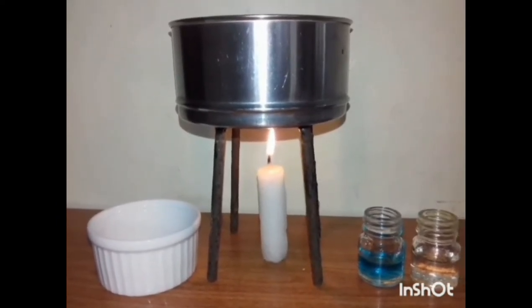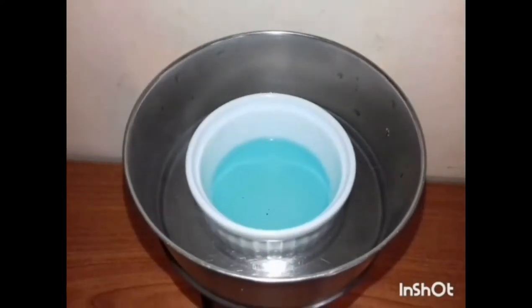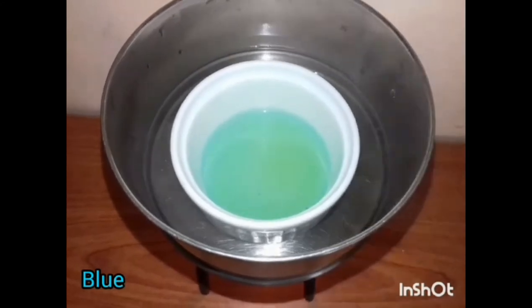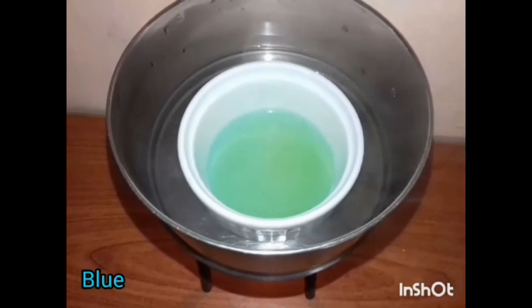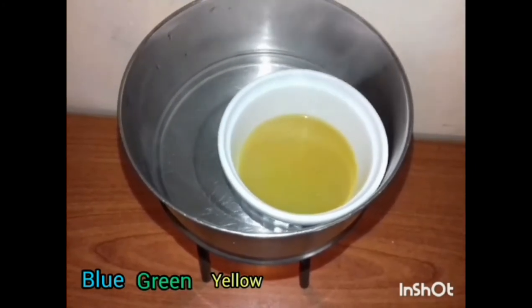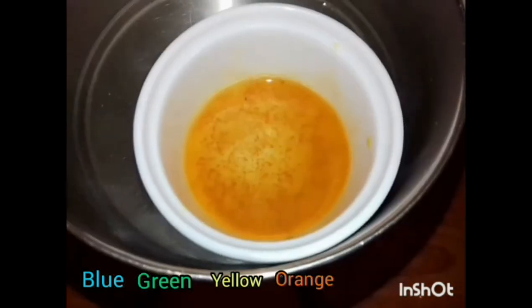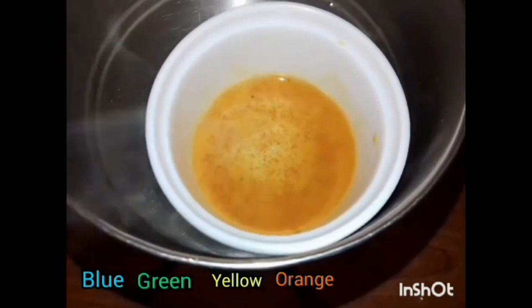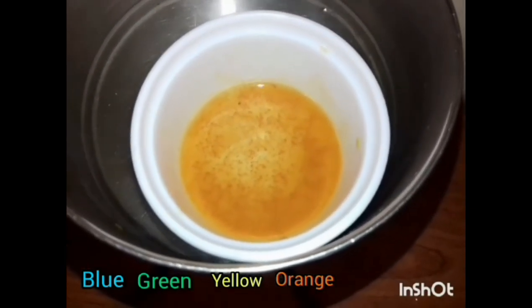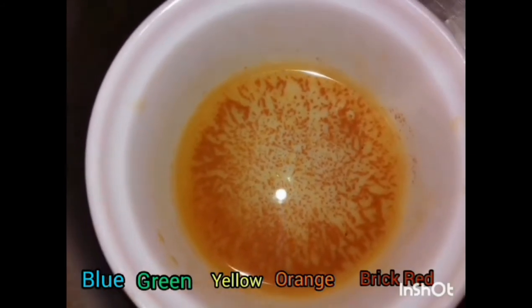First, I am going to add some glucose solution and benedict solution to the cup. Then I am going to boil it using the water heater. I am going to add some water to the water heater.